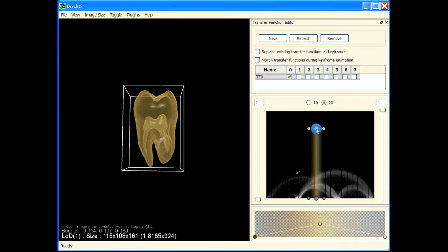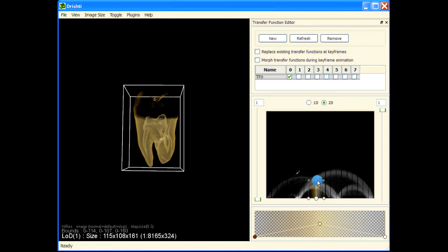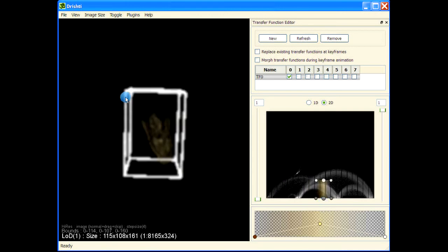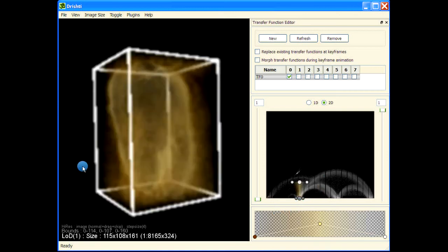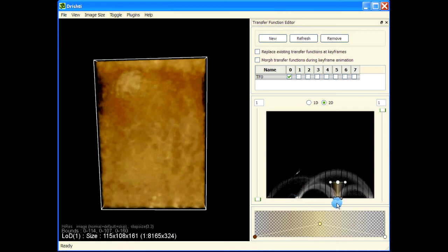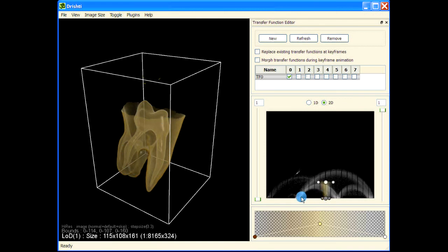I'm reducing this by bringing the top point down using shift key and left mouse button so that I move vertically — so even if I move my mouse anywhere this point will only move vertically. Using the middle mouse button I can move the entire spine around. I'm selecting just the interface between this region here and another homogeneous region here.